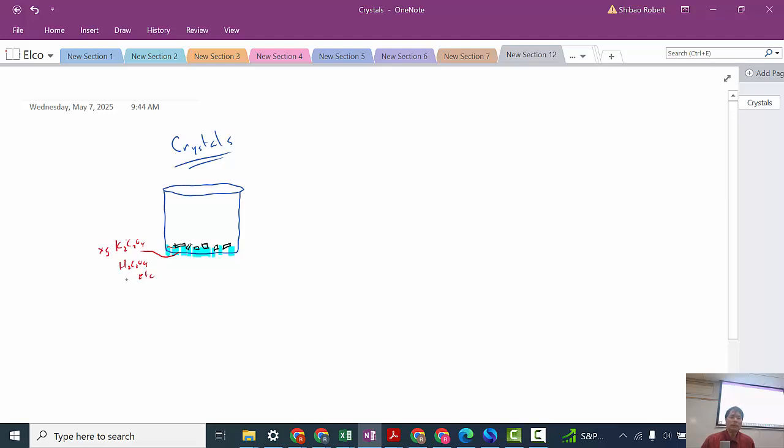These are white solids here. In solid form, hopefully these will be in aqueous form. In aqueous, we just have a CCS. In solid form, these are going to be a white solid. If you let all the water evaporate, then we're just going to be left with a solid, white solid residue, which is going to contaminate. So we're going to get co-precipitation. Co-precipitation means not only do we get the crystals that we want, we get the crystals that we don't want. And we don't want any of this white solid.